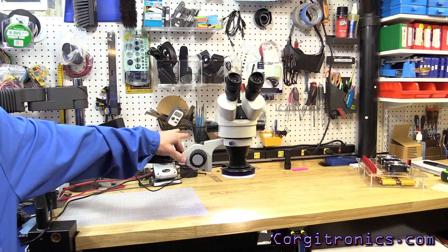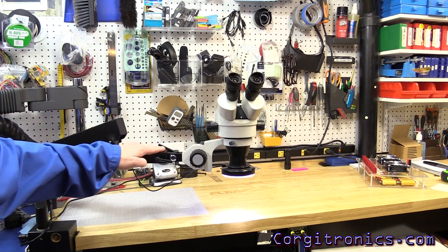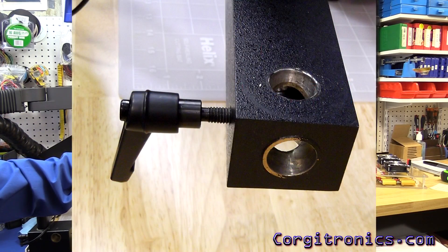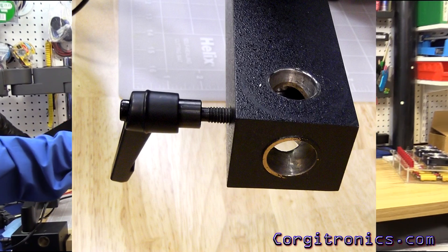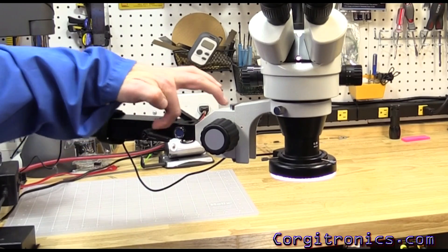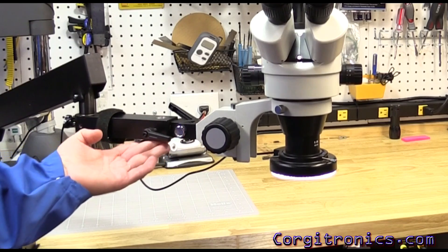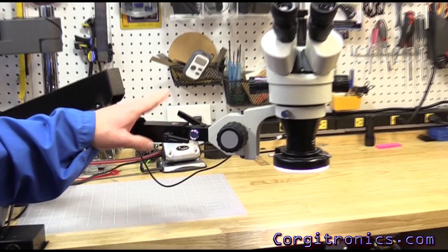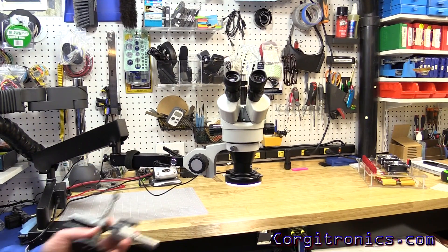The head and holder for the microscope can be mounted in a couple of ways. There's a set of holes, as you can see from this photo, and you can mount the head mounting pin either horizontally, as shown here, or vertically from the top or even the bottom. These are 16-millimeter holes — 5/8 inch.